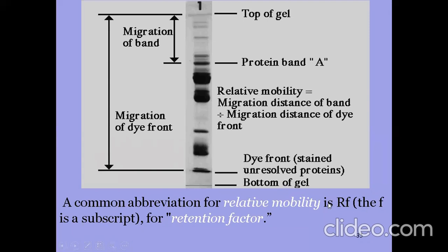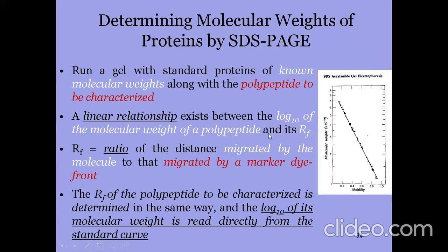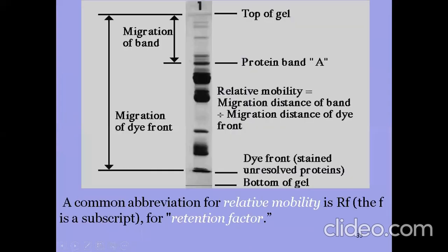So this will give us Rf, and Rf is in a linear relationship with the log 10 of the molecular weight of the polypeptide. Am I clear?